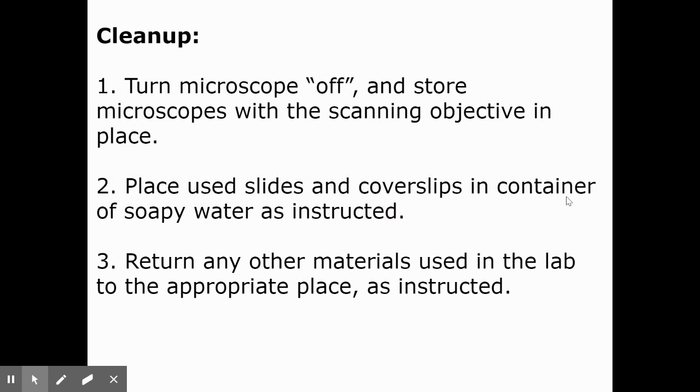Clean up. Make sure you turn your microscope off. Store always with the scanning objective, the smallest objective, in place, wrapping your cord around, putting a cover on it, that kind of thing. If there's a container, there should be a container, you can place your slides and your cover slips that you've used into the container so that they can be cleaned or processed so they can be used again. And then make sure you put any other equipment that you use back in the appropriate place so that it can be used again by whoever else needs to do it.